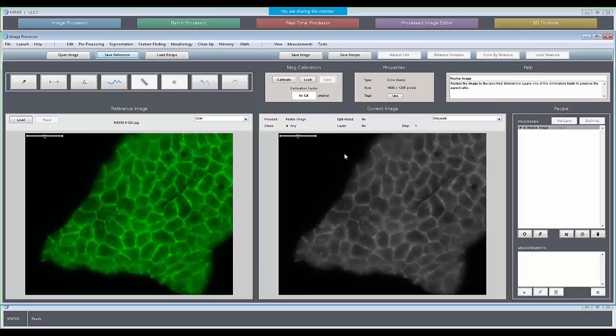Because this will probably be the first image that I'll take. I'll move right from this advanced segmentation example into making measurements, because this is a great example for that. Yes, thanks Leslie. You've got the size of the current working image up here in the properties panel.